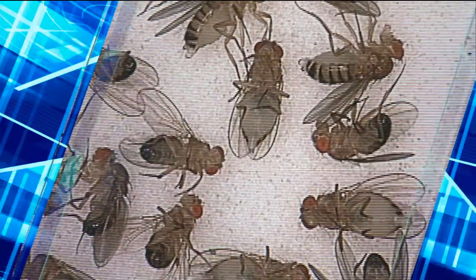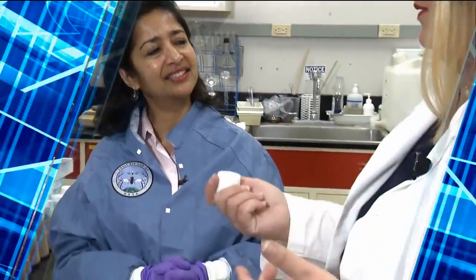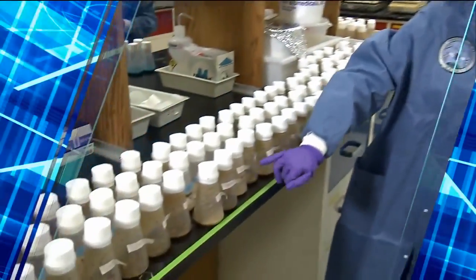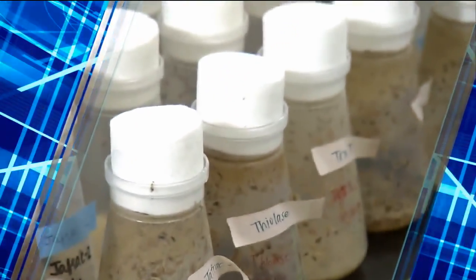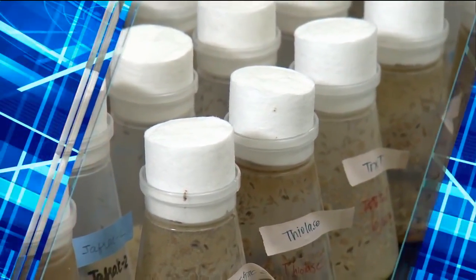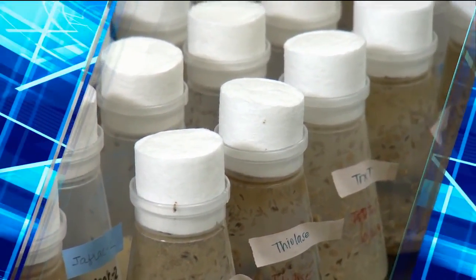But then the long-lived mutants can live almost 2 months. Wow. And I keep holding this, but yes. These are breathable. I mean, it's not sealed. Exactly. That's an excellent question. So yeah, these have actually living flies in them, as well as eggs, larvae, pupa, and the adults, which are all the life stages, and so they all need to breathe.